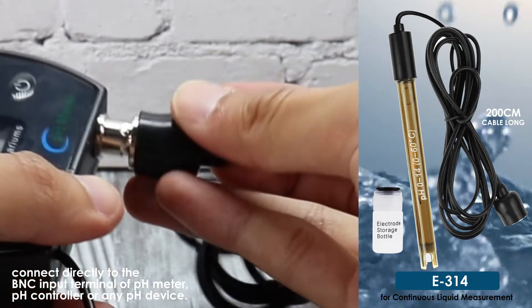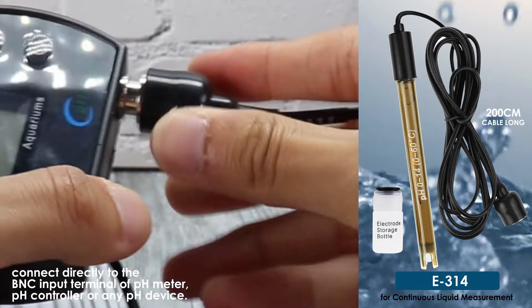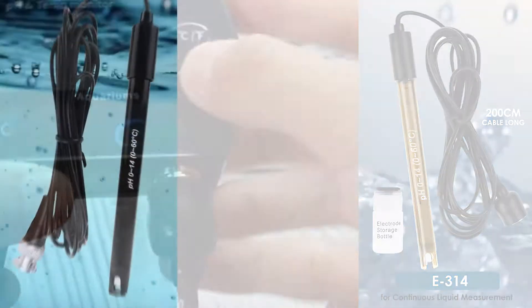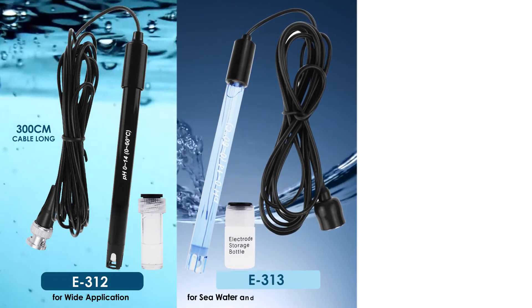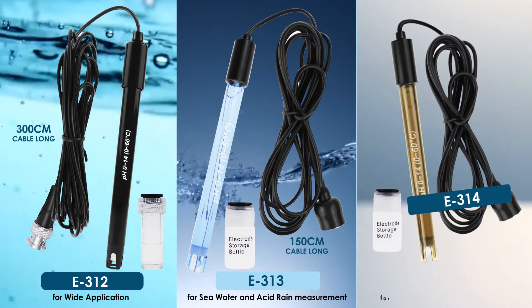E314 connects directly to the BNC input terminal of any pH device. Reuse your meter portion indefinitely with these replaceable pH electrodes.